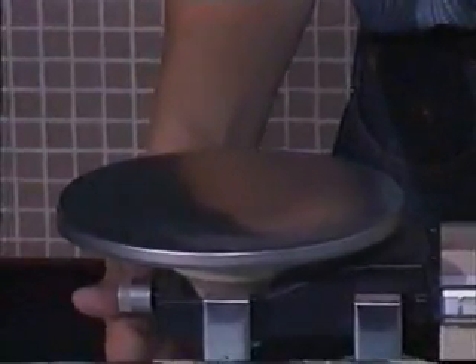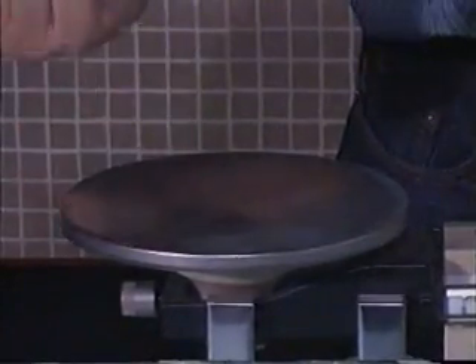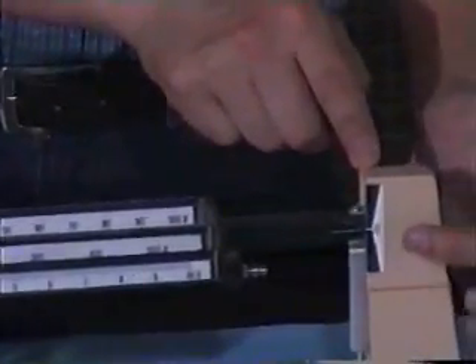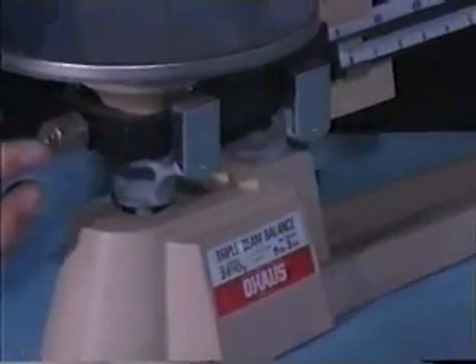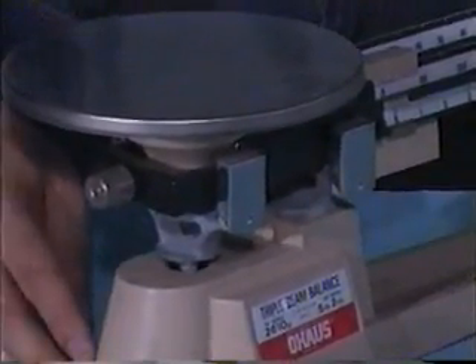The triple beam balance is divided into several portions. The first being the tray, where we place the object we measure. The second portion is the scale of these three beams. It connects with the pointer pointing to the zero. And the last portion is also very important — it is used for setting the zero point. Wind up this portion to set zero before every measurement.